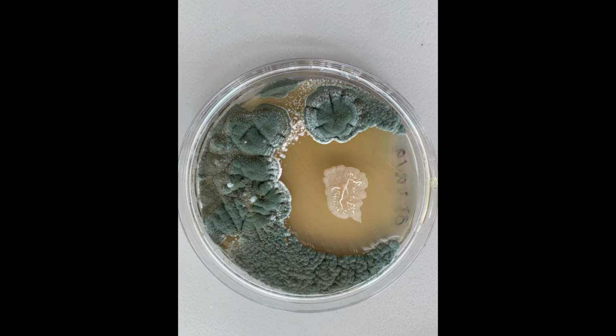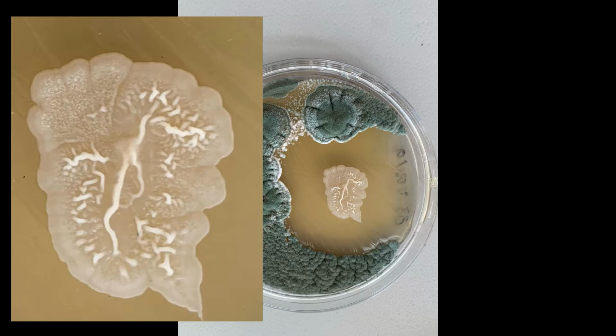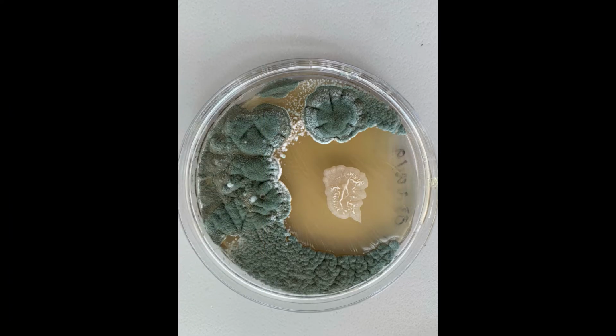I also observed both of them under the microscope. I'm pretty sure this yeast is Pichia. It has the shape of Pichia, but again, it's not a 100% accurate identification. The mold is definitely a Penicillium, it looks like a Penicillium, but I'm going to show you how it looked under the microscope.